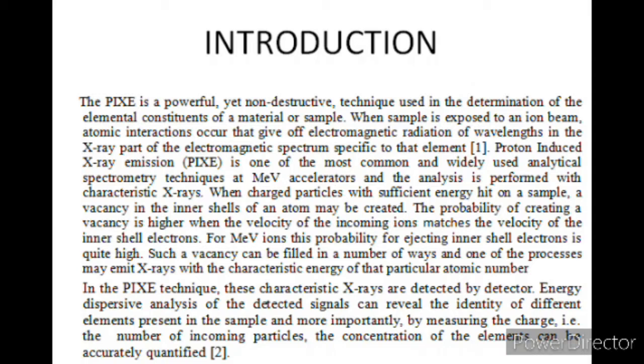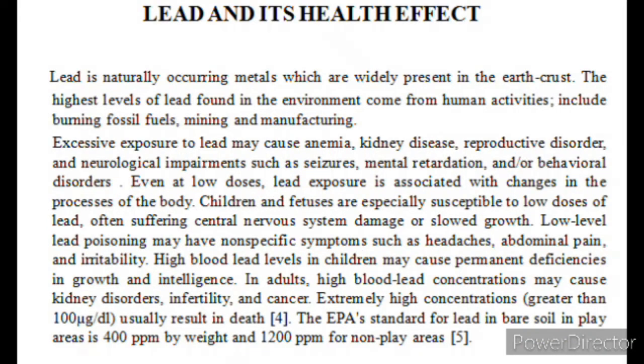In the PIXE technique, these characteristic X-rays are detected by the detector. Energy dispersive analysis of the detected signal can reveal the identity of different elements present in the sample, and more importantly, by measuring the charge, that is the number of incoming particles, the concentrations of the elements can be accurately quantified. Particularly, this research is based on the determination of lead.